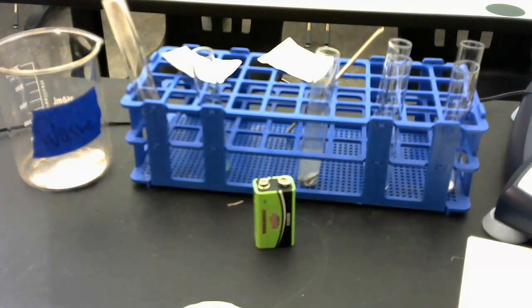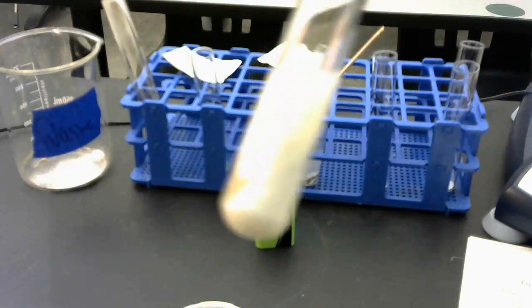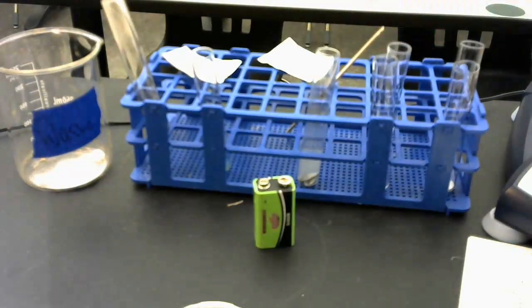So what we created here, if we were to filter that out, that white substance is called silver chloride that we produced. And a precipitate basically is formed because it's not soluble in solution, meaning it will not be able to dissolve in solution.